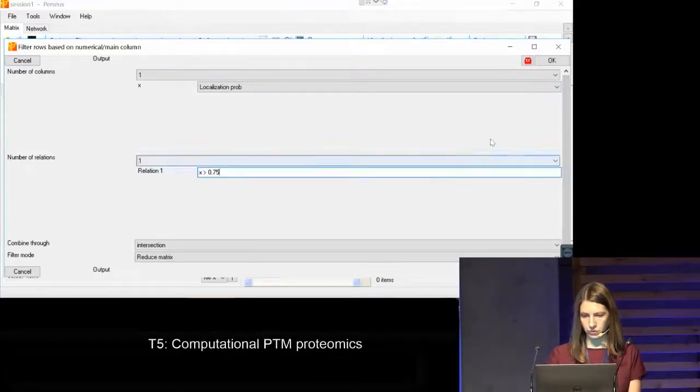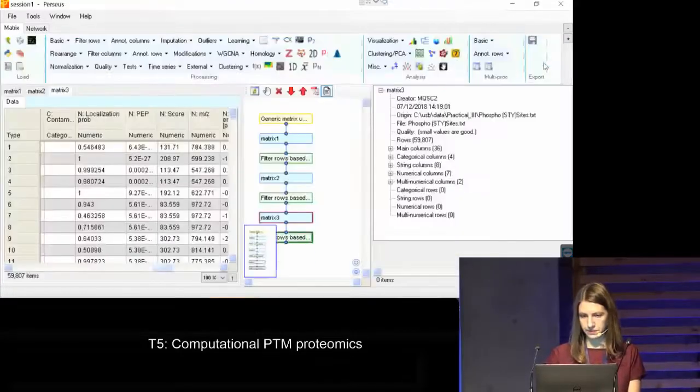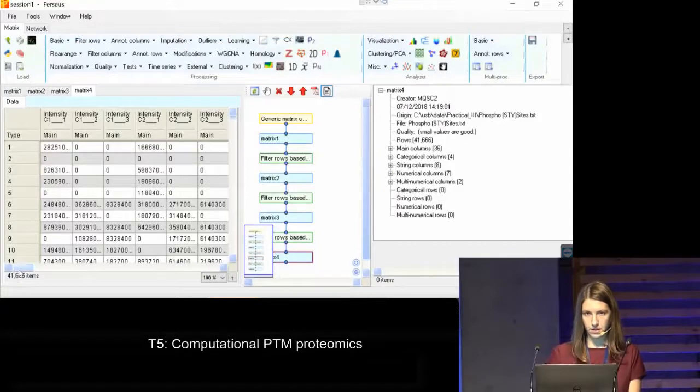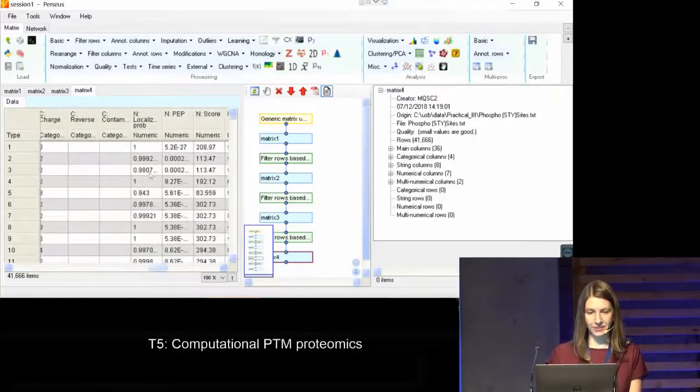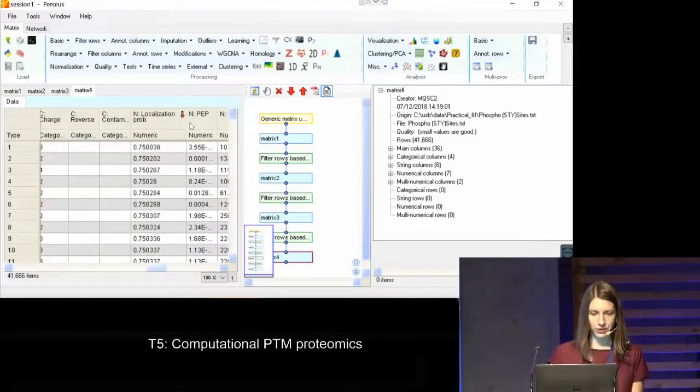And we do not need to change anything else. You can try. Did you put it? I did, yes. I did use spaces. Okay, so you can use it with or without spaces. The formula doesn't change anything.